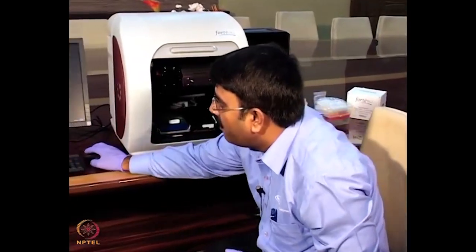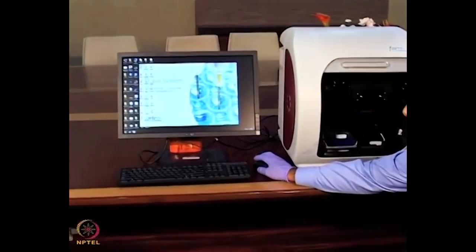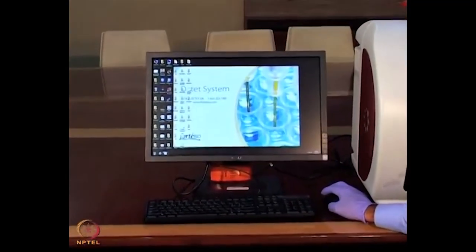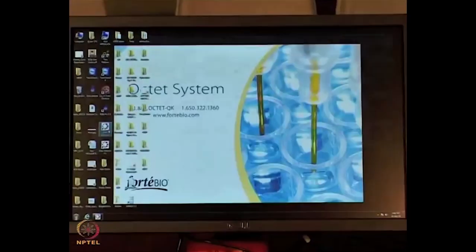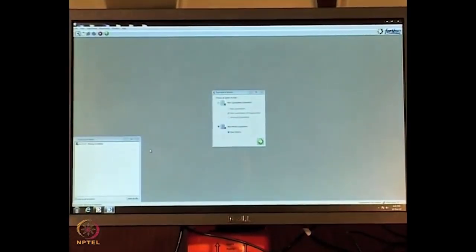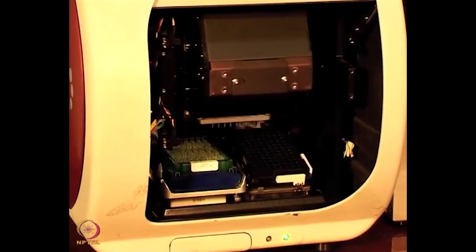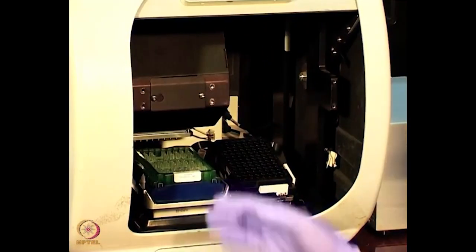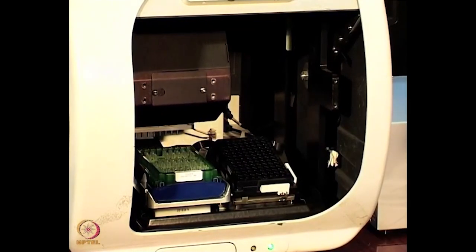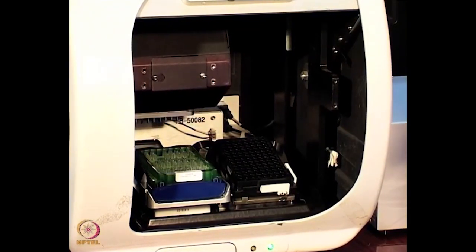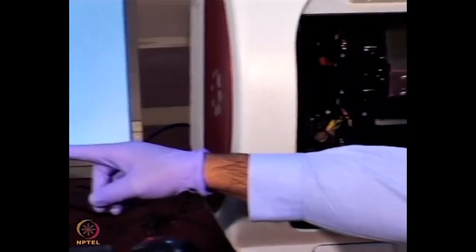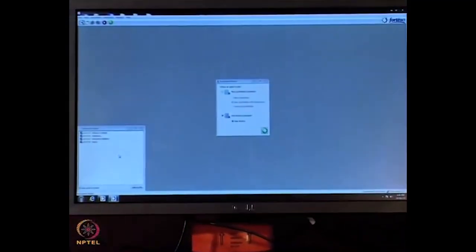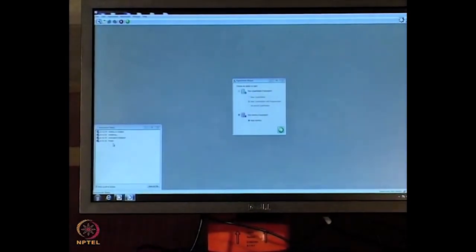We are placing the sensor rack. In the software, on the Octet Bio platform using BLI technology, we have acquisition software as well as data analysis software. I will show you the acquisition software and its features. If I double-click, the instrument starts initializing — it moves in the X, Y, Z direction and initializes itself. The initialization process takes roughly 30 seconds. You can see the events in the dialog box. Now it is showing that the instrument status is ready.